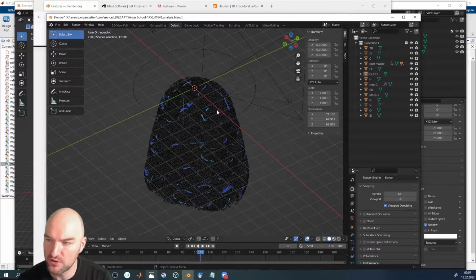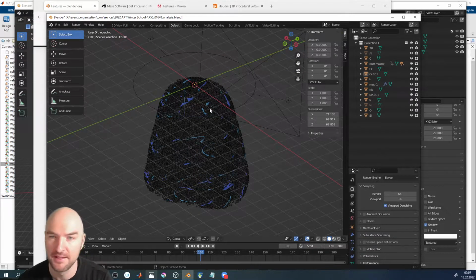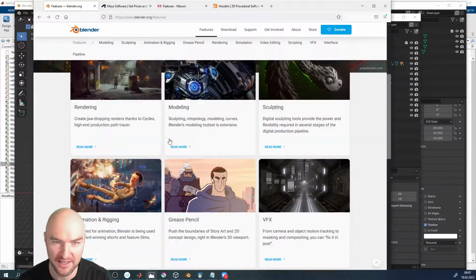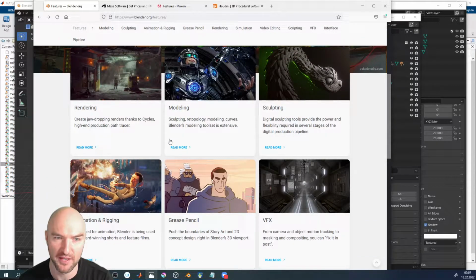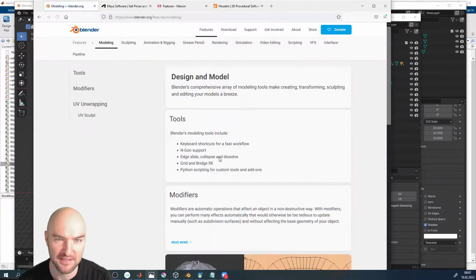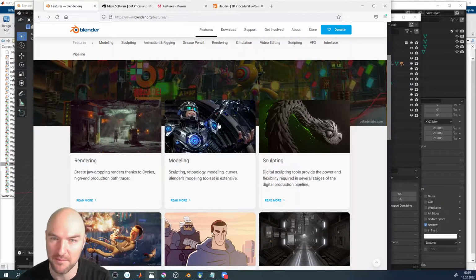Okay, so what we are going to use today to that end is a program called Blender. And Blender is an open source 3D modeling suite. You can go and download that from blender.org, and I hope all of you have done that and have looked into the fundamentals of how to use Blender, some mesh modeling and so on, because we are going to make use of that a lot. And you can see you can do quite funky things with that. If you look at this model here, you can model stuff really for cinematic purposes, or for 3D printing, or for whatever you like. And we're going to model for AtomProbe tomography.